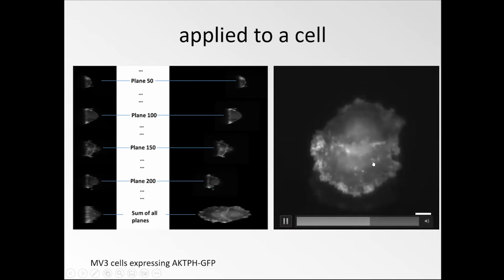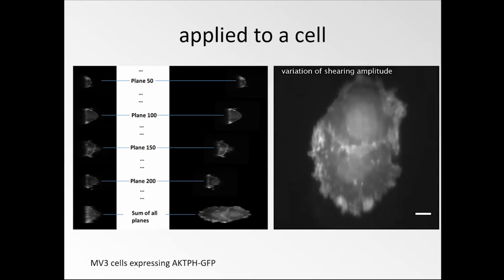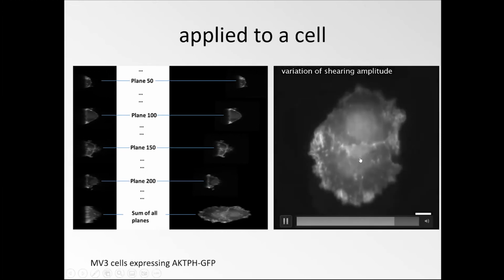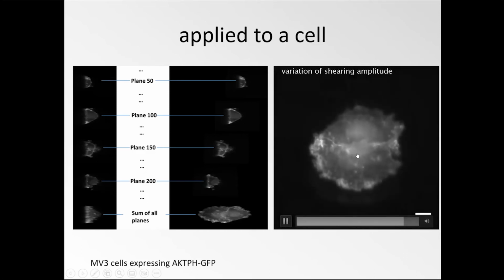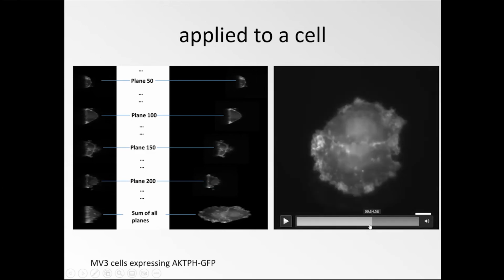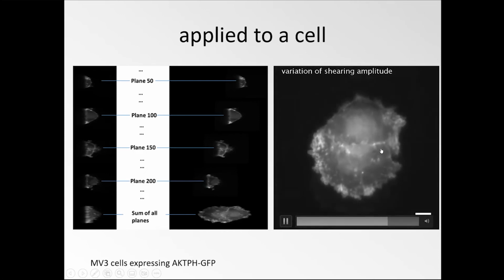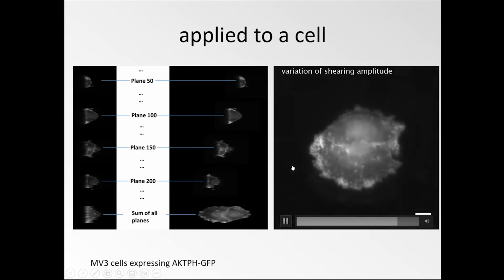And then if we change the voltages of the signal generator, so again, this is done without any computation, this is really purely analog, if we change the amount we shift images, we can actually create a rotated view with an additional stretching, with scaling. If you go really to the extreme, the image also becomes a bit elongated, but nevertheless, you may appreciate that visually, to our human brains, it looks like the image is rotating. And per the shear warp transform, it actually does.